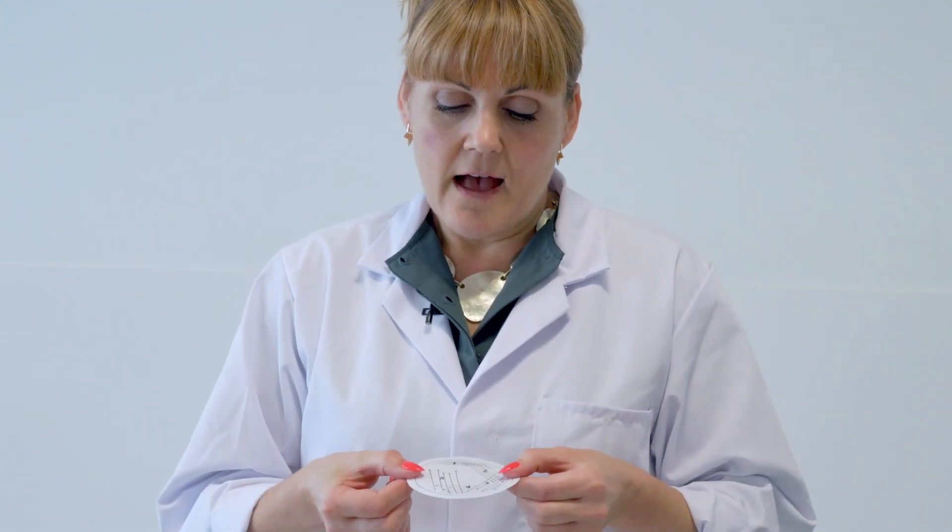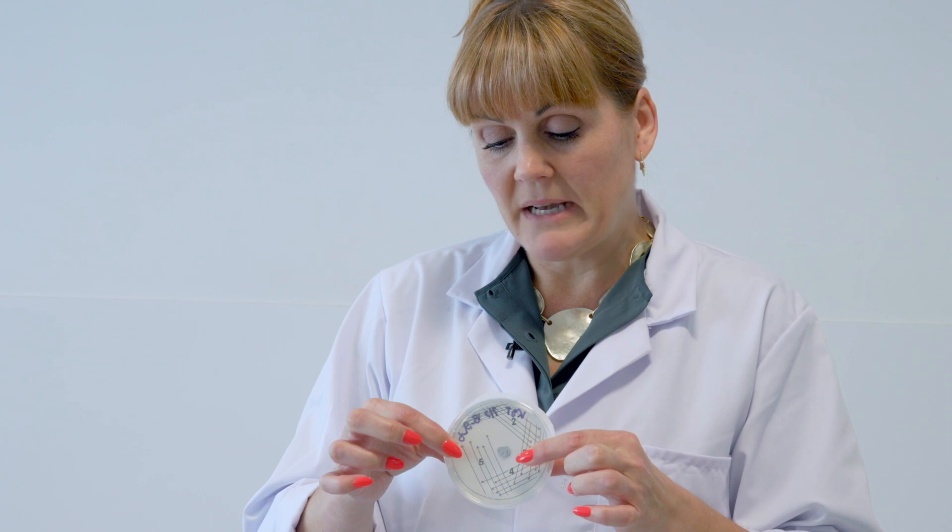We use a stencil for streak plating, which looks like this. I'm going to use a tiny blob of blu-tack to attach the template to the bottom of the Petri dish — otherwise, because I've Virkoned the bench, the paper would just slide all over the place. That is my stencil to create a streak plate. I want to turn it so that part number one, the well where I first deposit the bacteria, is closest to the Bunsen flame.